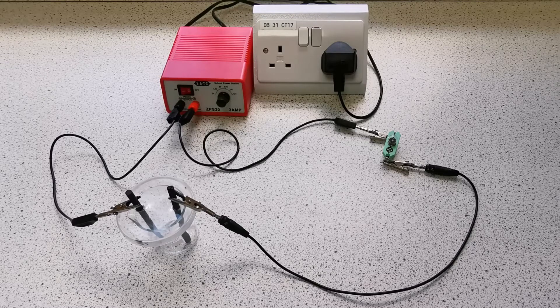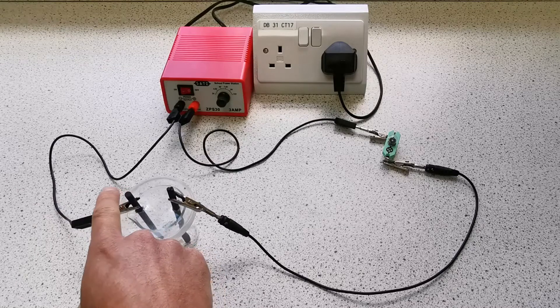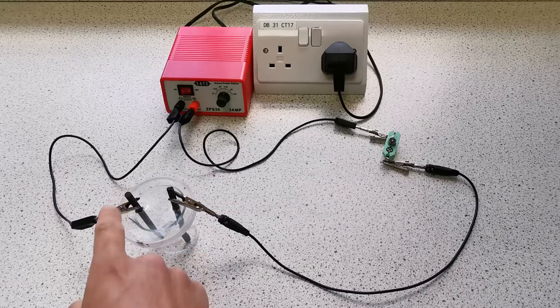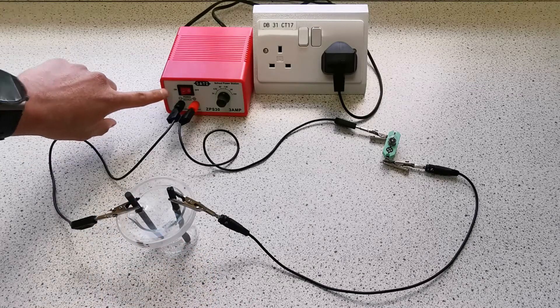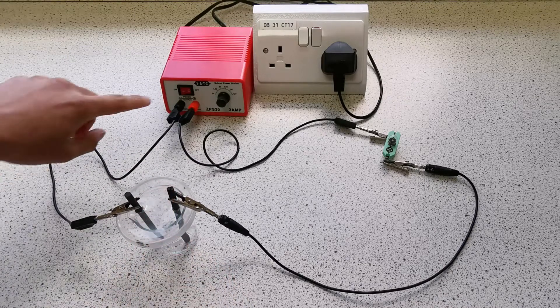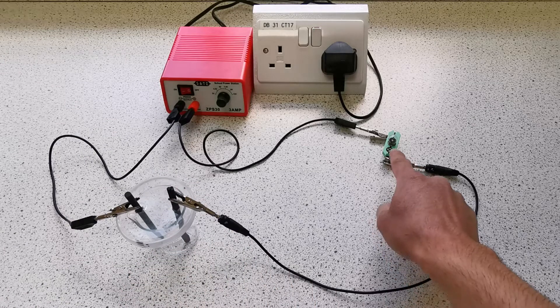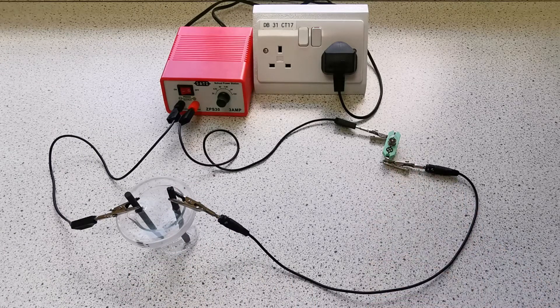This is the equipment I'm going to be using. I've got a power pack connected to an electrode — this is going to be the cathode as it's connected to the negative side of the power pack — which means this is the anode, connected to the positive side. We also have a light bulb to show us that the circuit is on and working.